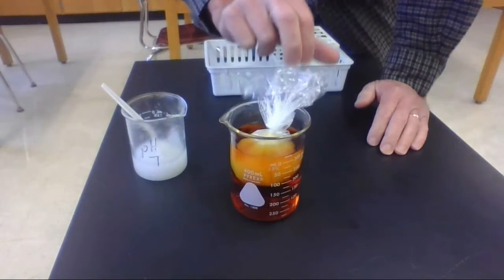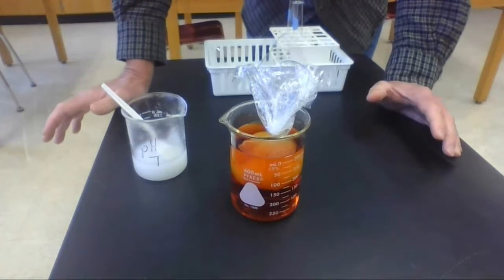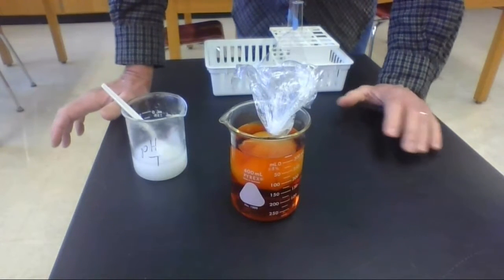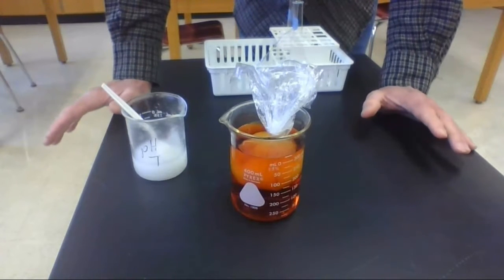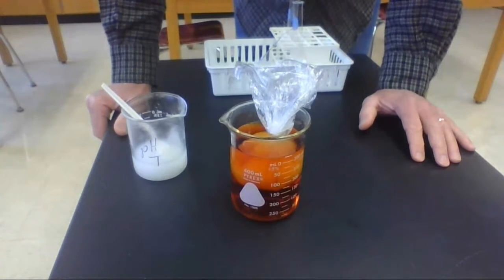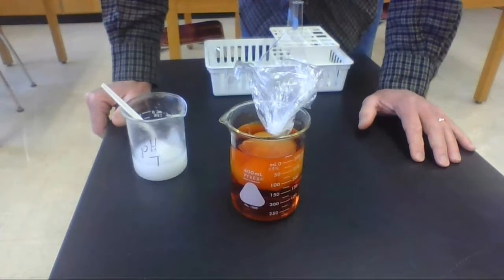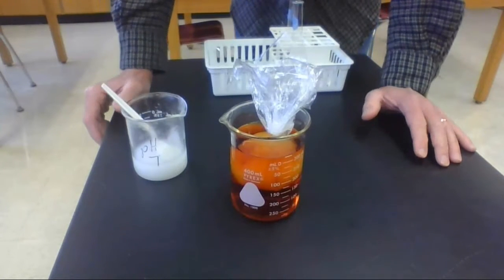And what we want to find out is, is the baggie permeable to the iodine or the water or the starch? And if so, is it a decent model of a cell? So what we're going to do is let this sit overnight. And we'll come back and take a look at it, and see if anything's happened to give us some evidence.